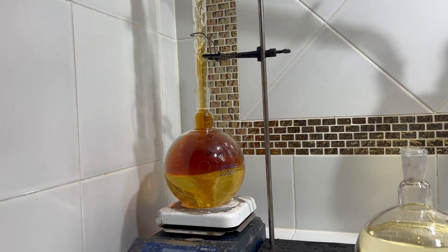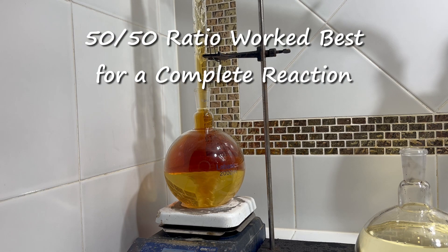One issue I did run into was not adding enough sulfuric acid, as you can see in the boiling flask in the front here. When heated, your boiling flask should look like the one that's up on the hot plate.